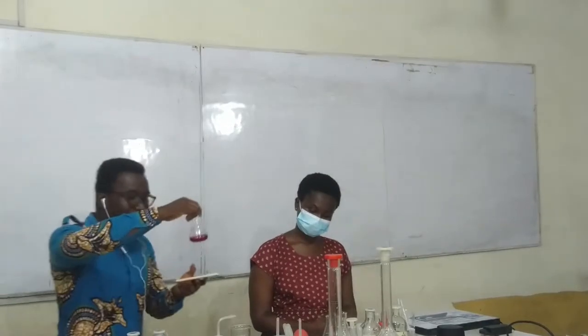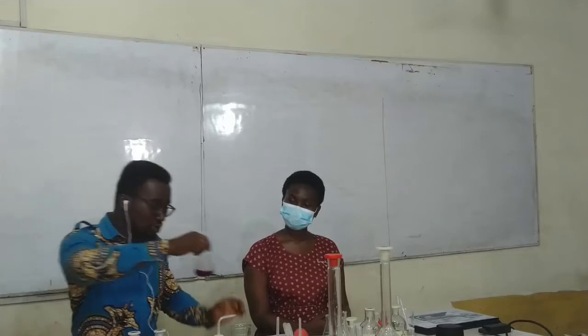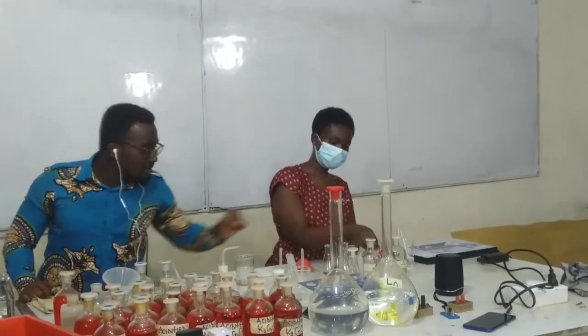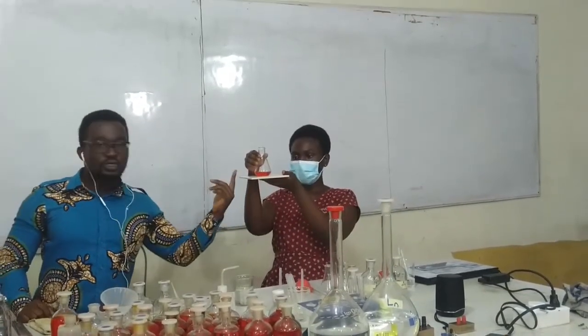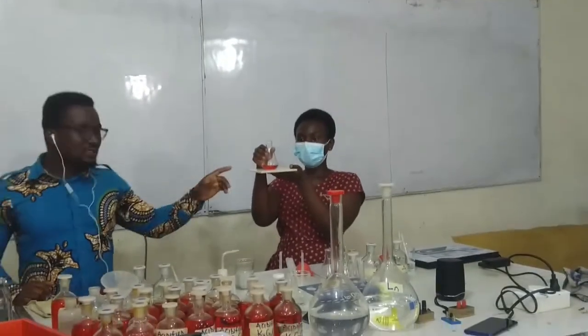Now, we have been able to know the nature and then the colors that will be formed in the various solutions. We are going to explain it bit by bit, one after the other. Madam, pick solution A. Solution A with that color. Good. Now, solution A with methyl orange formed.